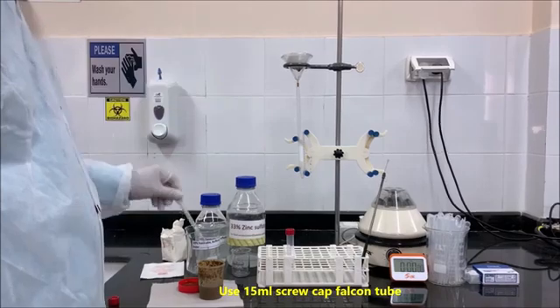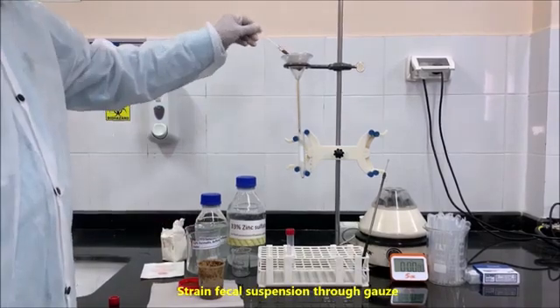Use 15 ml screw cap Falcon tubes. Strain fecal suspension through gauze.